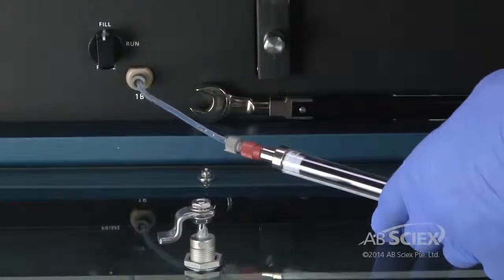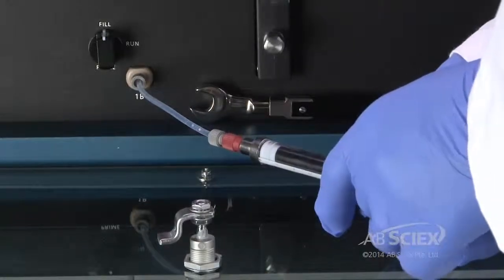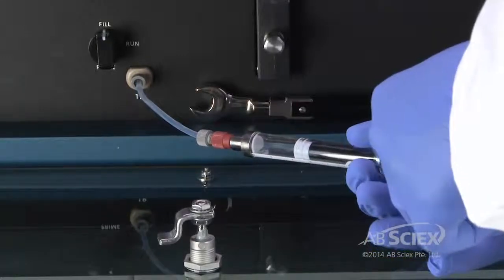Rotate the Prime Valve knob to fill. The fill position connects the syringe to the mobile phase bottle. Pull the plunger to fill the syringe.